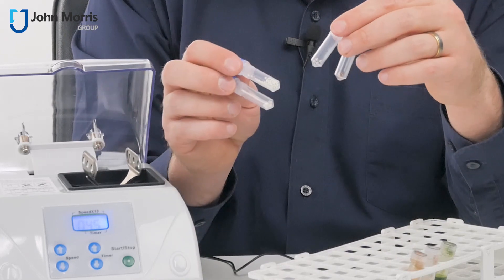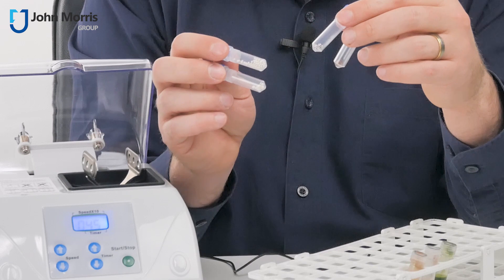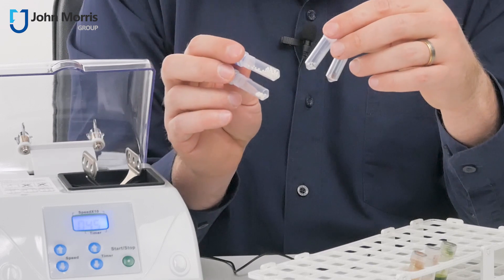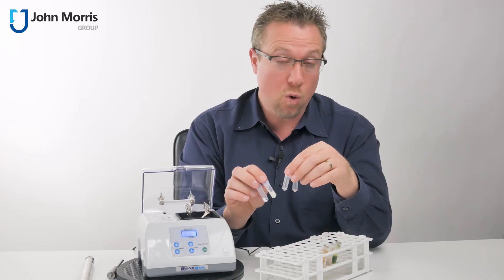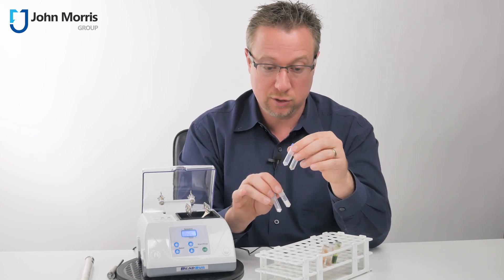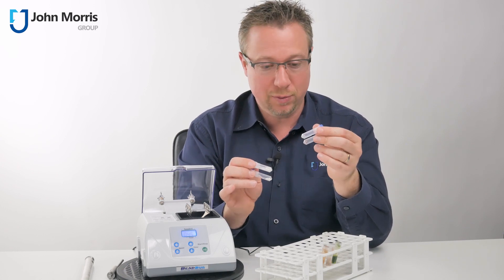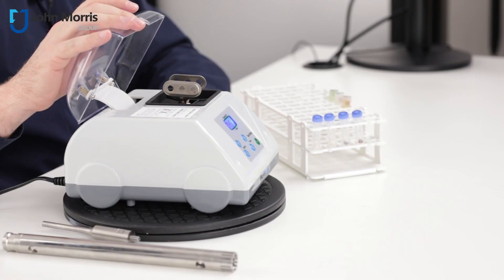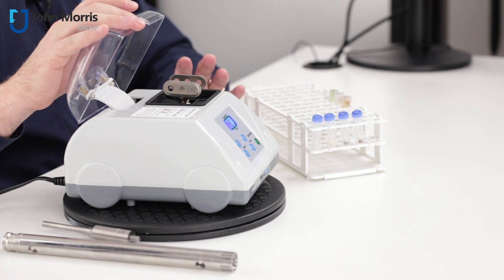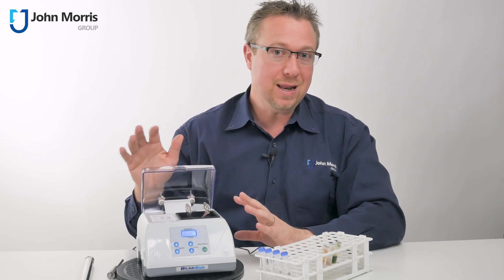So you have a choice of different materials and different sizes of beads. You've got stainless steel, you've got zirconia, you've got glass, and you get them in a pack of 50 — pre-sealed inside the little tube. Or you can buy bulk beads or empty tubes. How much would you expect to pay for this? The best part is it's only in the vicinity of $2,000. So when you put together the package you're talking a saving of many thousands of dollars.